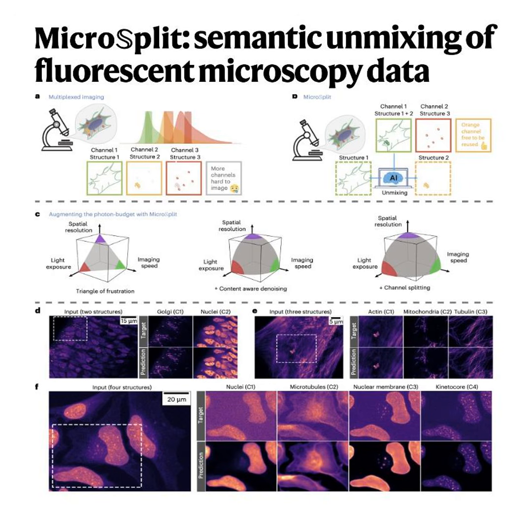That's a perfect analogy. And if all 100 experts draw the exact same microtubule filament in the exact same spot, the AI is highly confident. But if those 100 drawings are totally different, the AI realizes it's just guessing based on the noise. Exactly. By analyzing the variance, the disagreement between all those internal sample solutions, MicroSplit calculates a spatially resolved prediction error.